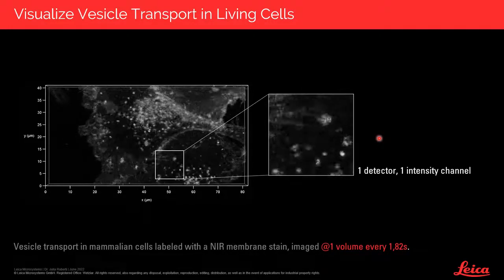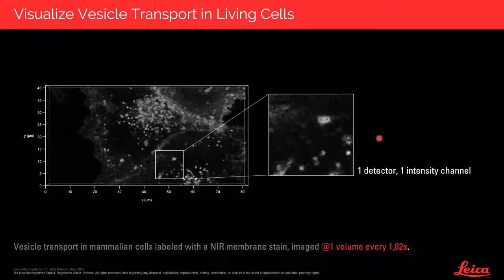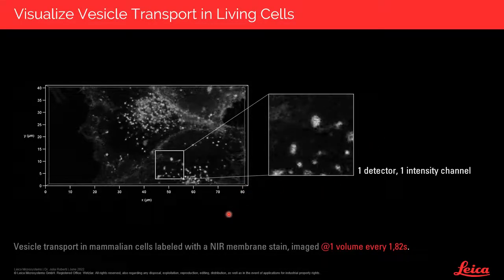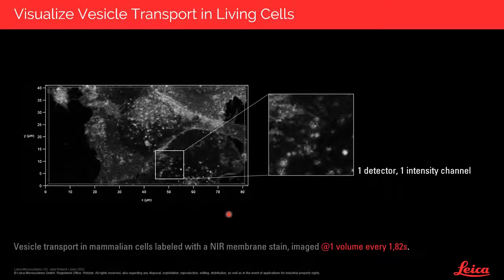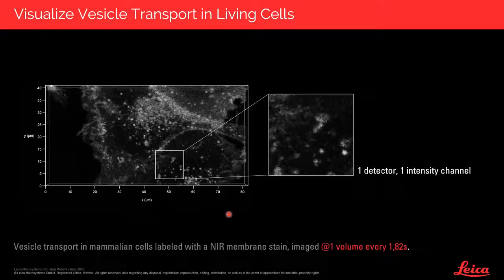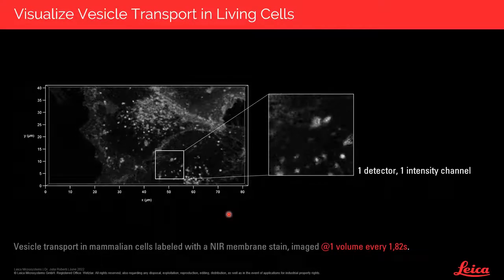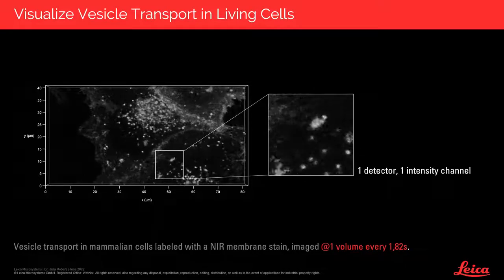We have developed these tools because we know that one aspect of fluorescence is the intensity, but there is an extra dimension, which is the lifetime dimension, and we want to access that on our confocal. And we want to do that because with lifetime we can sense environmental changes, and that can give us access to functional information to characterize, in this case, endosome maturation.